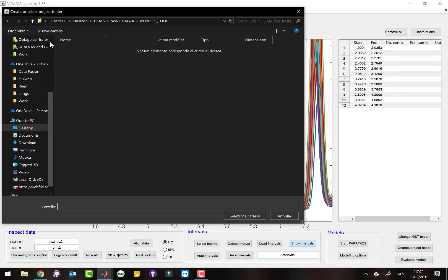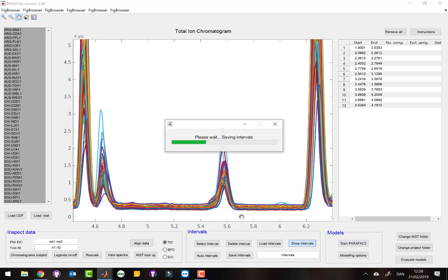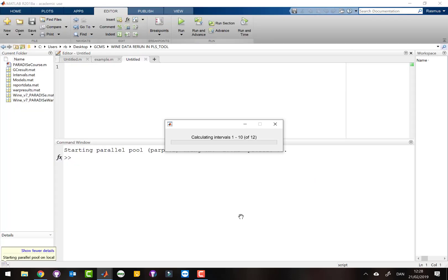I first have to select a folder — I'll just use this one — and this is where all the results are going to be saved. Now you can go grab a coffee because this is going to take a while. We will take a short break and then continue once it's done.